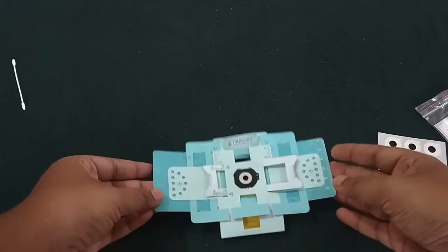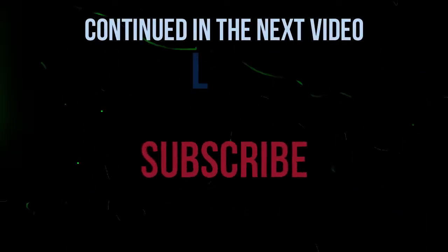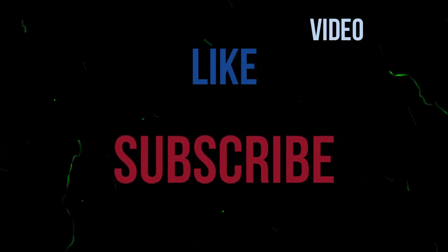So let us see how to see the microorganisms through this. This is the first step.